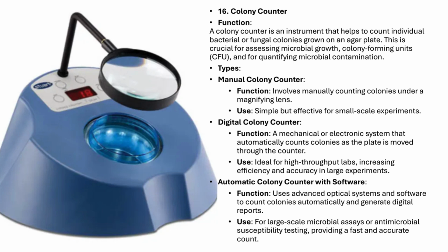Digital colony counter. A digital colony counter is a step up, offering a mechanical or electronic system that automatically counts colonies as you move the plate through the counter. It's ideal for high-throughput labs, improving both efficiency and accuracy.